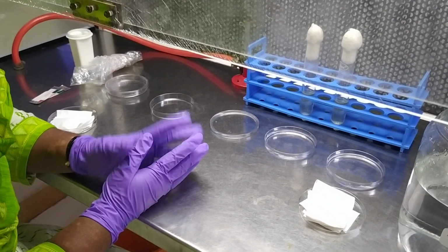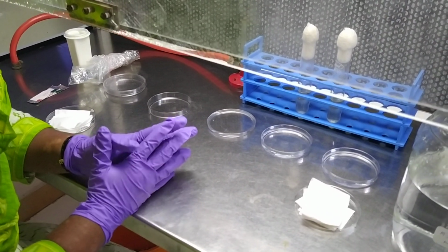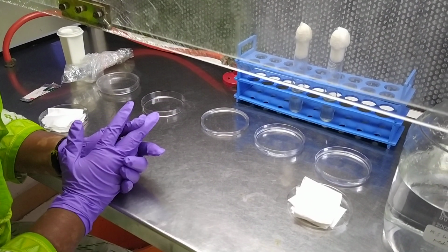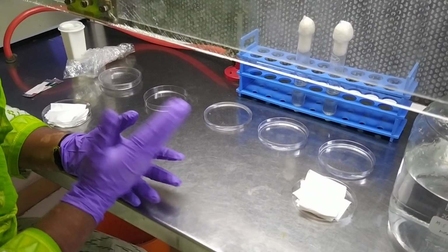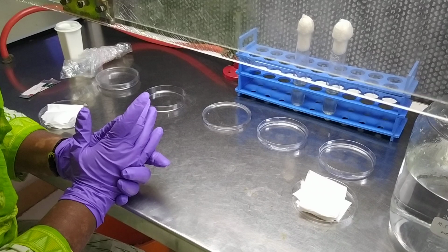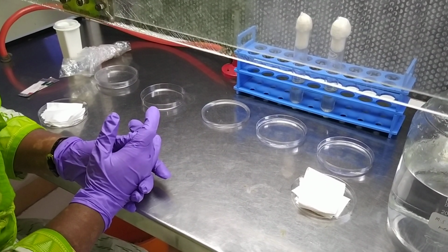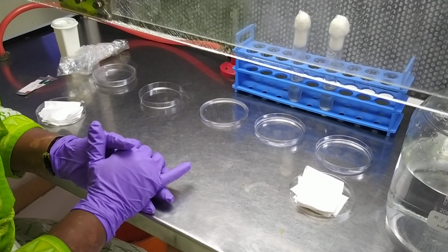Direct organogenesis and indirect organogenesis. So to produce an organ from an organ, or to take differentiated cells, convert them into an undifferentiated mass, and then back to the organ system. Before moving on to how the explants have to be produced and how we are going to inoculate, preliminarily setting up a sterile environment is most important.